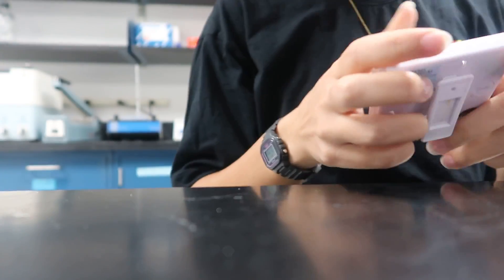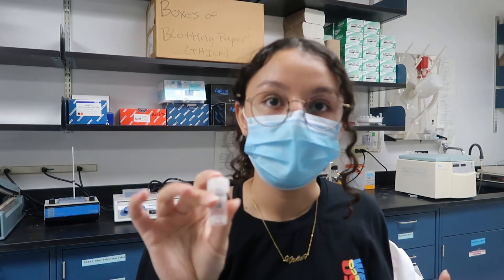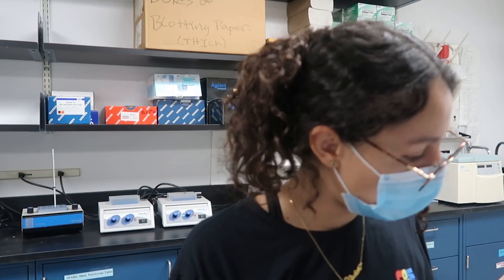This is also going to be for two hours. So now I need to make 5% normal donkey serum because that's what the rest of my protocol calls for. And then later I need to make more PBS because a girl is out.